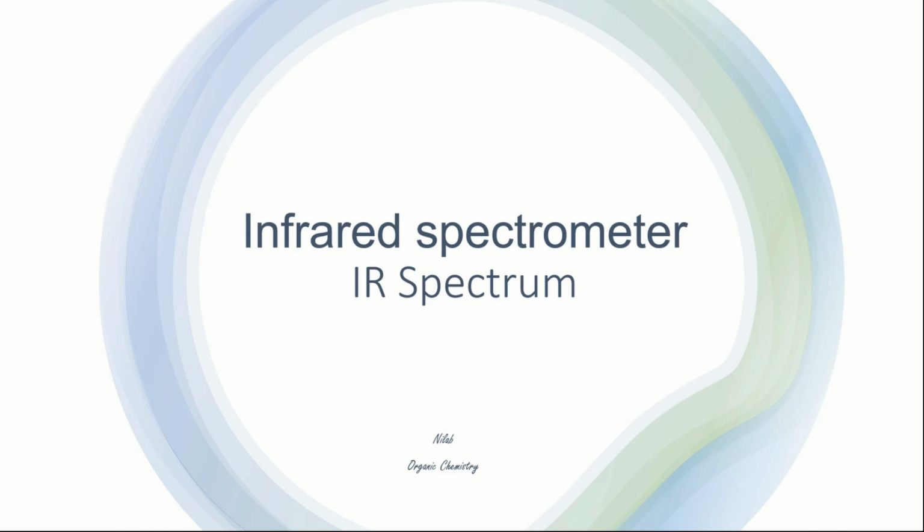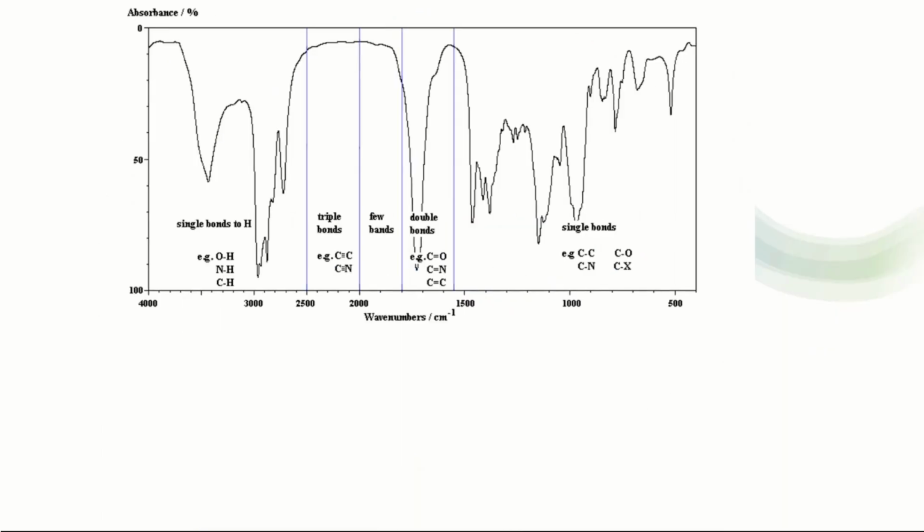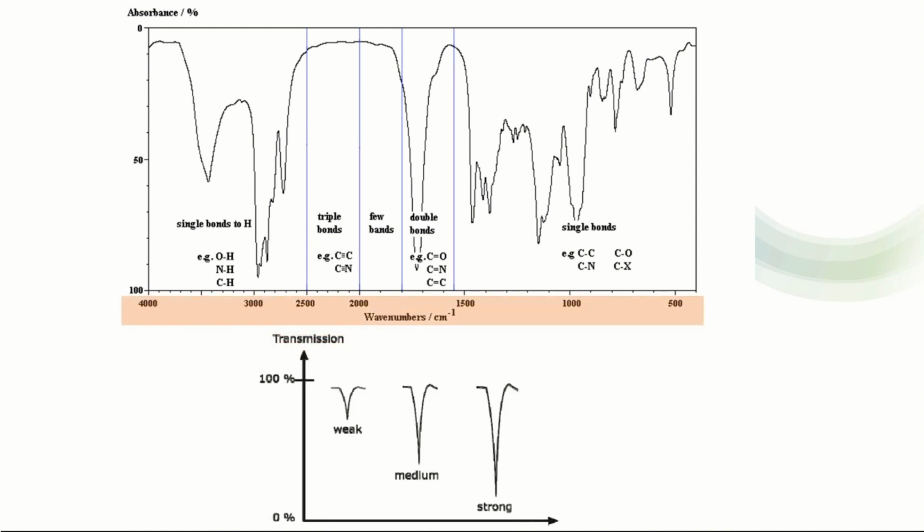I'm here again with another important topic of organic chemistry, which is IR spectrum. Here I have a sample of IR spectrum. So let's look at the axes first.